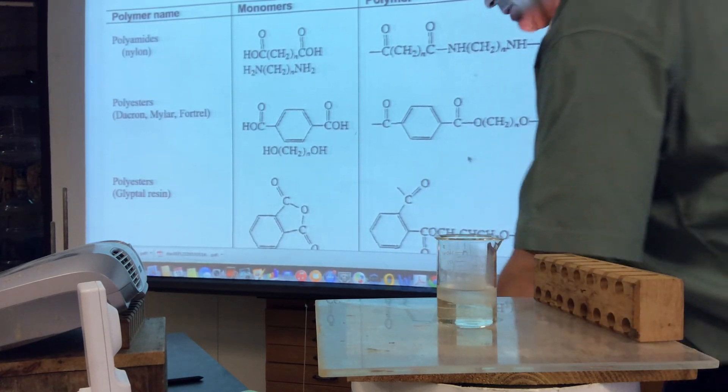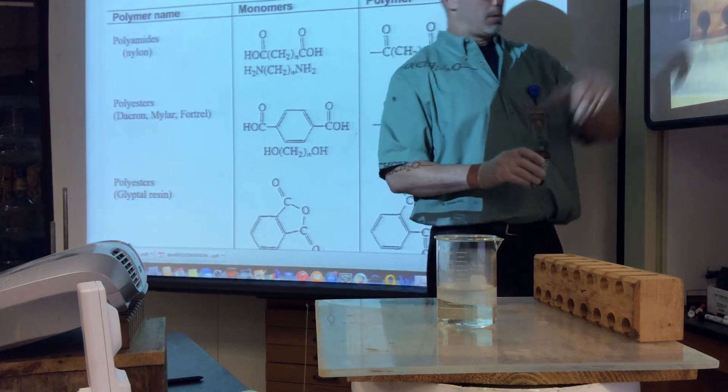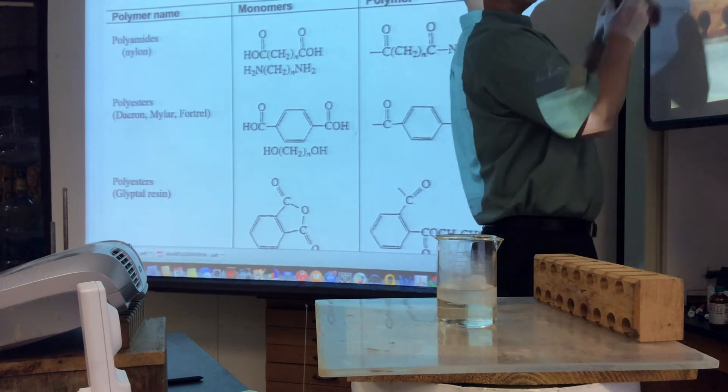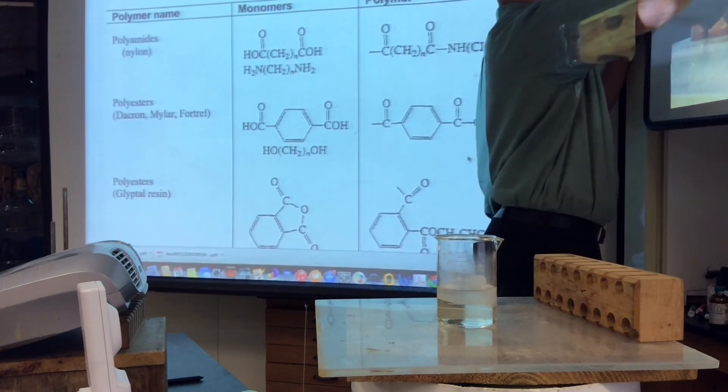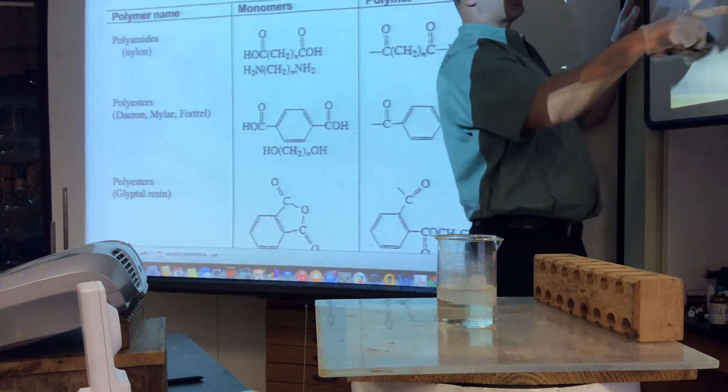So you can see the two liquids. Well, you can definitely see the two liquids. Let me just get this off here so you can see what's going on. Now, you also can see some vapors. There's definitely high vapor pressure associated with this. So you've got the two liquids.